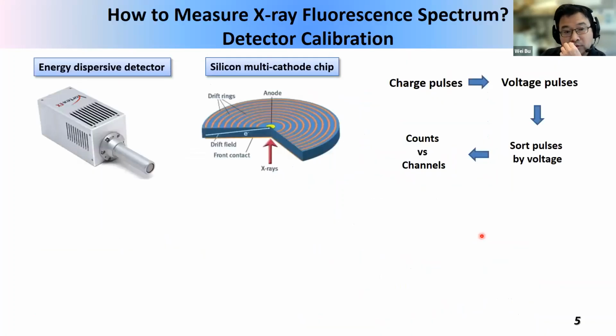Okay, now let's go to the third question. We're not there yet. Okay. The third question here is how to measure an X-ray fluorescence spectrum, like the spectrum we showed in the previous slide.